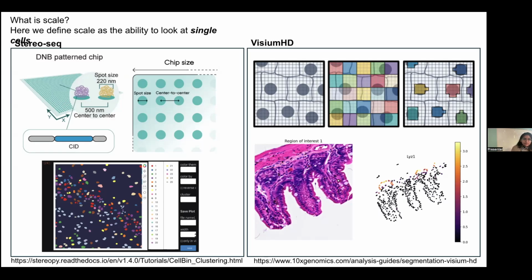You can stain your tissues. As Amina has mentioned, most of it is H&E. I've also not seen anyone try out fluorescence and then run it through a Visium HD. Some people will argue you can do an exact sister section, do your staining, and image register it.